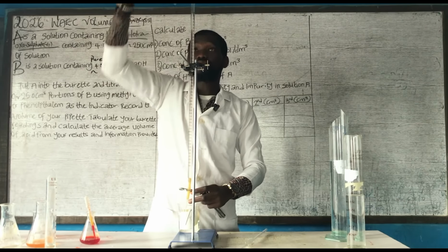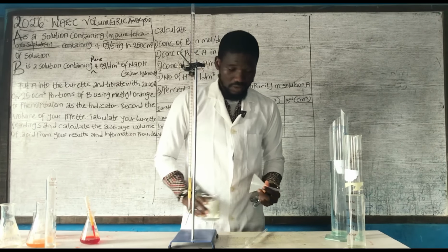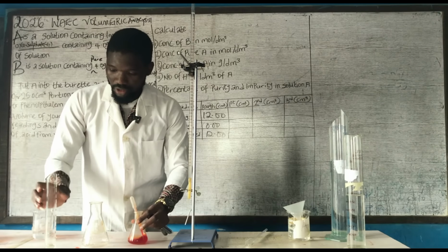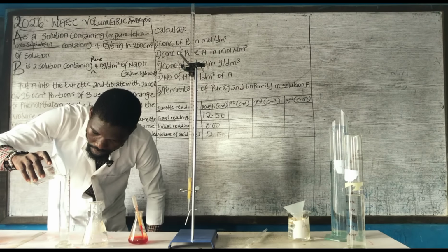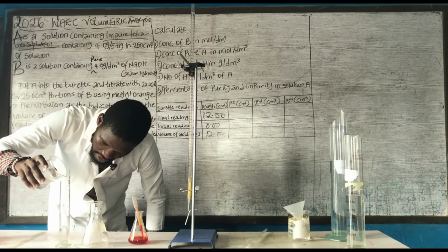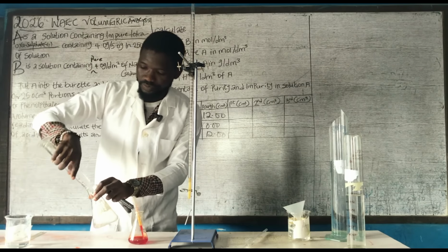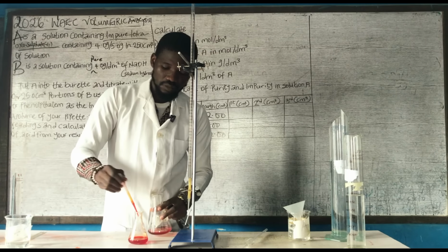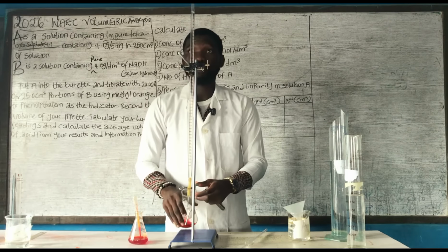So you remove this. Take another measurement of the base. 25, don't forget. I have this. First drop and the second drop.